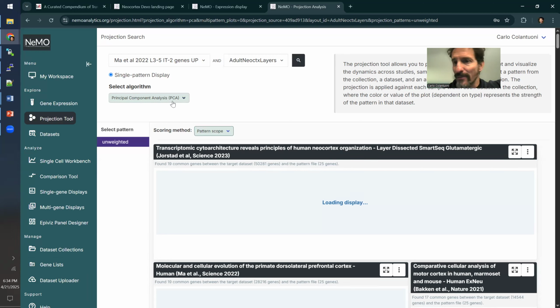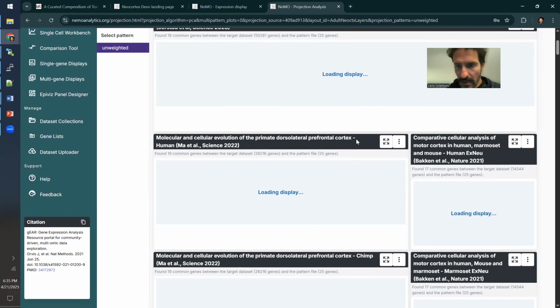Here the algorithm for this is not too important. When you project a principal component, the math of it actually boils down to summing up the weighted expression of each gene in the principal component. And that works fine for us here. These 25 genes, they don't have weights. When there's no weights, it just assumes each one is 1, and all 25 genes are summed up. There's lots of different ways to project here. Just counting how many of these 25 genes are expressed in any of your cells, or if you had a PCA or NMF algorithm output a whole dimension, we also have options for that.